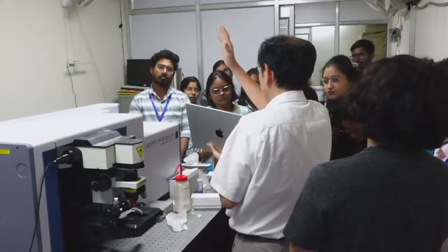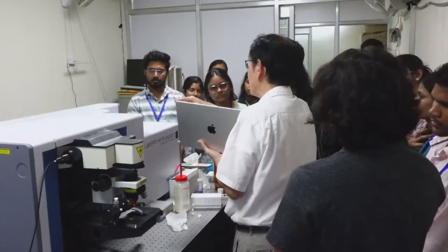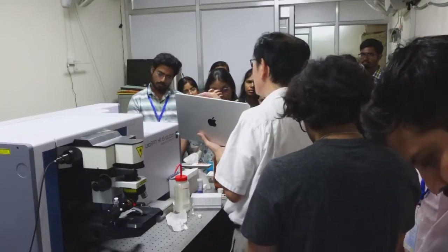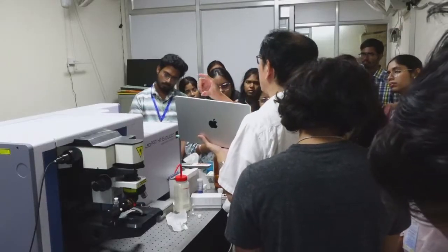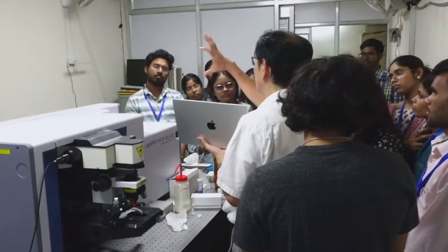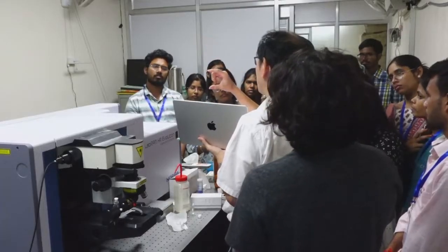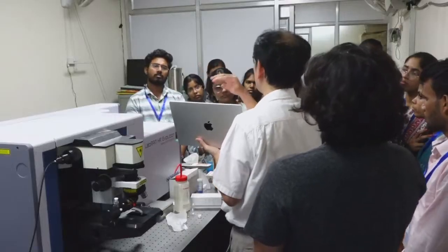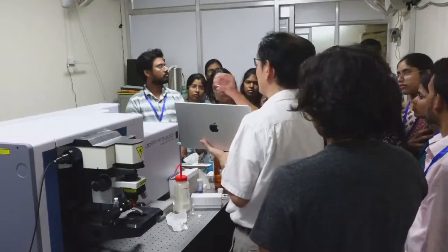That is, the continuous spectrum is detected by CCD, and at that time, the CCD will judge this intensity is count 1, this intensity is count 2, this intensity is count 3. Okay, how about 1.5? Okay, 1. So it digitizes the continuous number to a digit number.